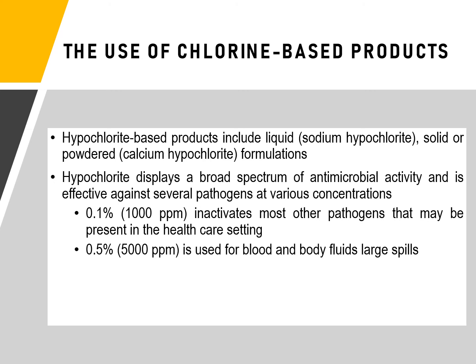These formulations dissolve in water to create a dilute aqueous chlorine solution in which undissociated hypochlorous acid is active as the antimicrobial compound. Therefore, regardless of the concentration used, it is important to first clean surfaces thoroughly with soap and water or detergent using mechanical action such as scrubbing or friction.